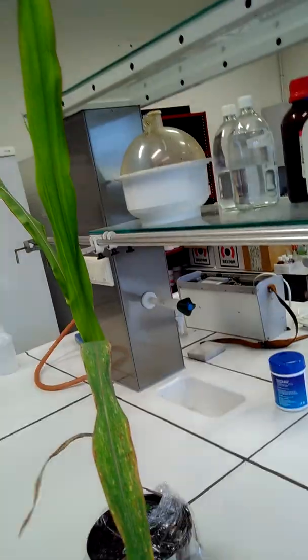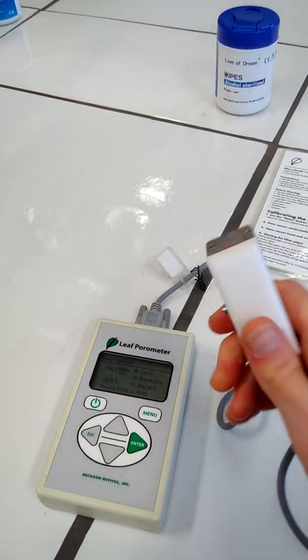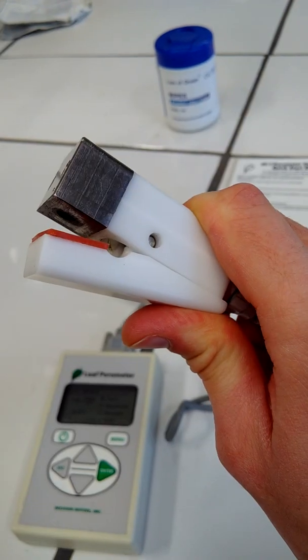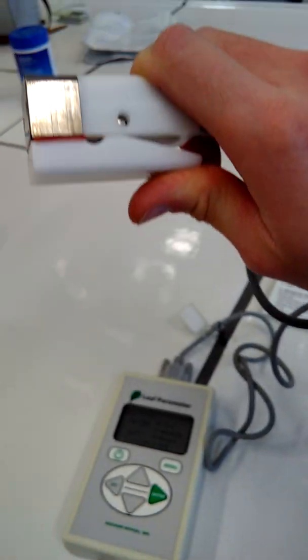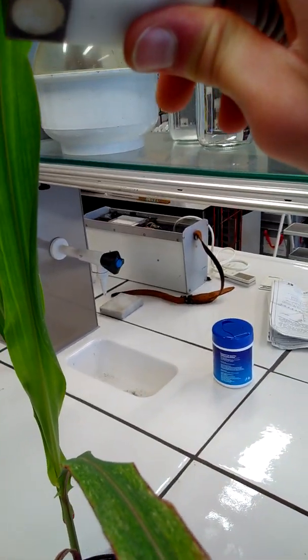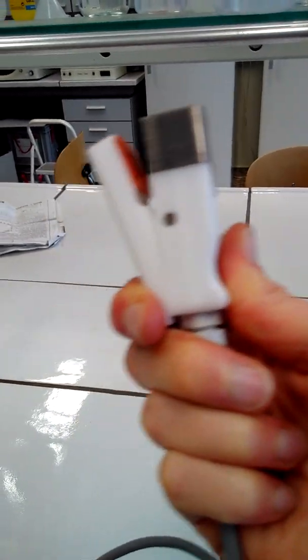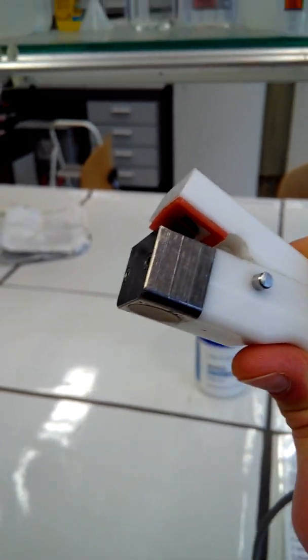Now before going to the actual plant, first I'll explain a bit more about the principles of the device. You have this chamber, and when it is attached to a leaf, what will happen is this: first the chamber is in the open air, and the water vapor concentration or pressure is the same as in the outside environment, so it's in equilibrium with that.